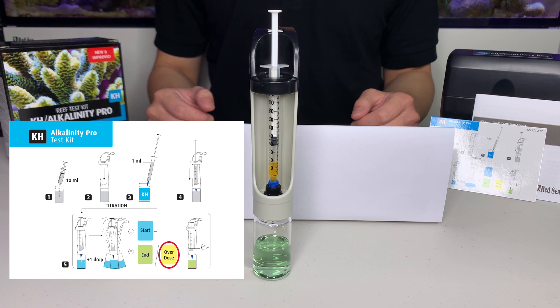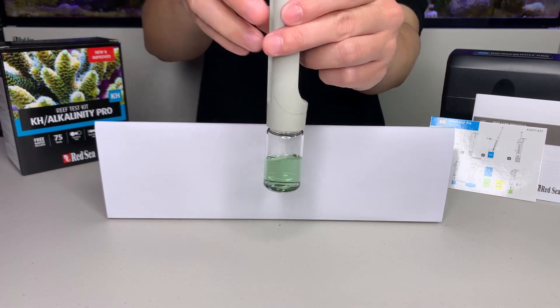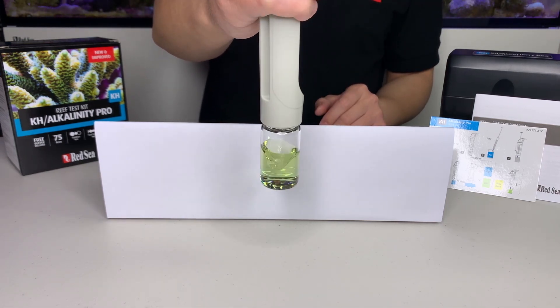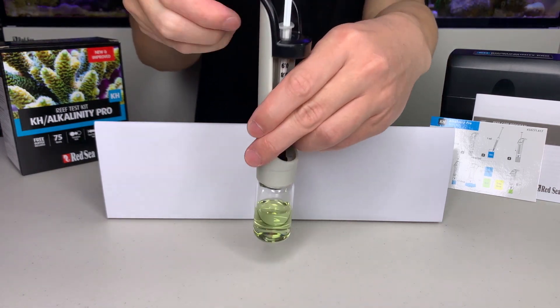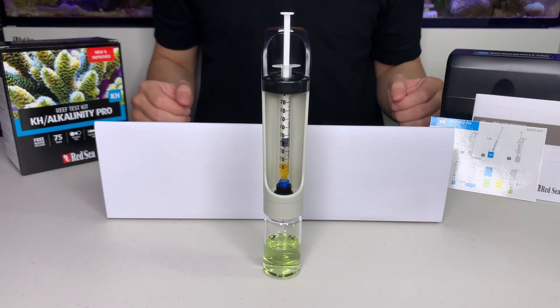With the KH-PRO test kit, it will also show a third color which indicates overdose of titrant. Now let's add a couple more drops of the titrant and see what happens. As you can see, the water sample has turned yellow, which indicates you have overdosed the titrant, and you must start the test again.